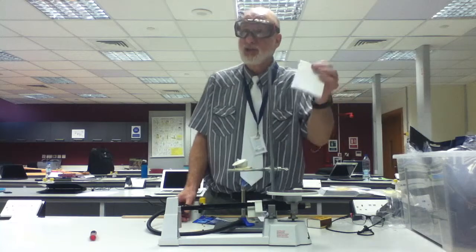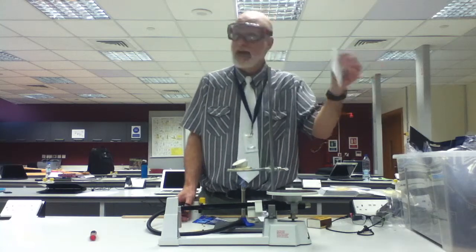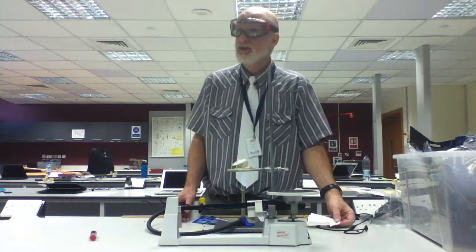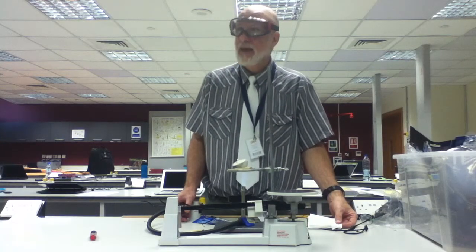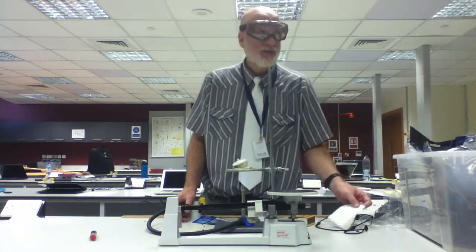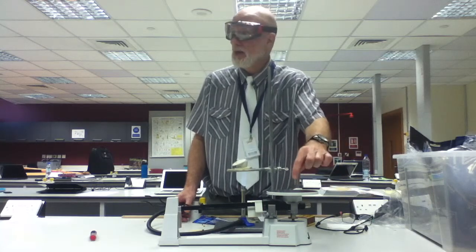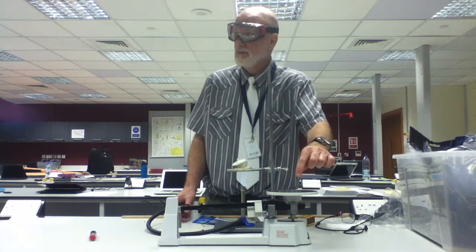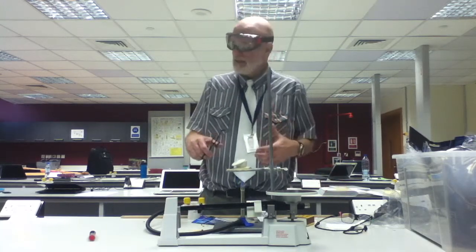So what do you have to do with the mass of the paper towel and the mass of the magnesium? Find the mass of what? Just the magnesium. Then you can take this off. This you can put on a hot crucible on that stage. Clear? Okay. So then you heat it, it reacts.